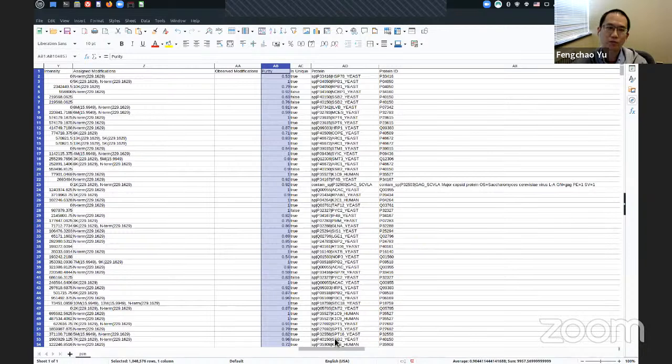If you just want to perform the peptide identifications, yes. For the quantifications, it really depends on what you want to do. For PRM or SIM, you can do the quantification at the MS2 level or MS1 level, or together. It really depends.